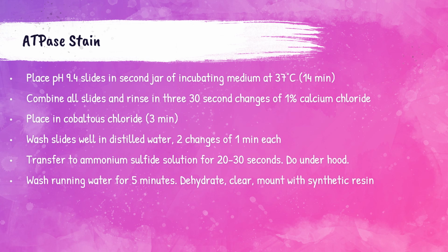Then transfer to ammonium sulfide solution for 20 to 30 seconds, and you want to make sure you do this under the hood. After that 20 to 30 second period, you want to wash in running water for 5 minutes, then dehydrate, clear, mount with synthetic resin.